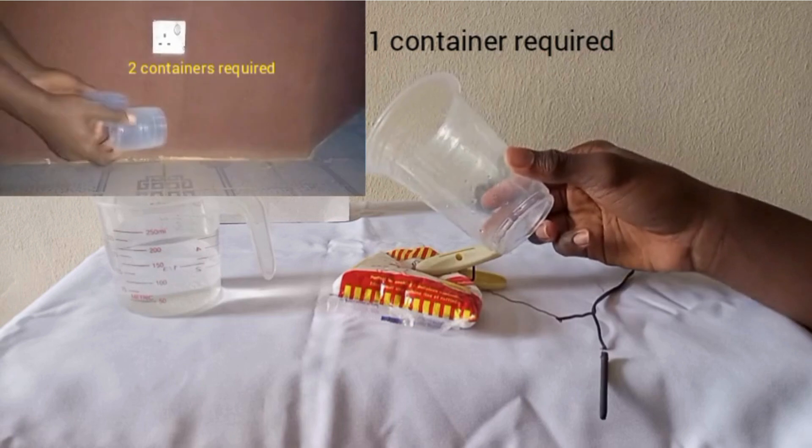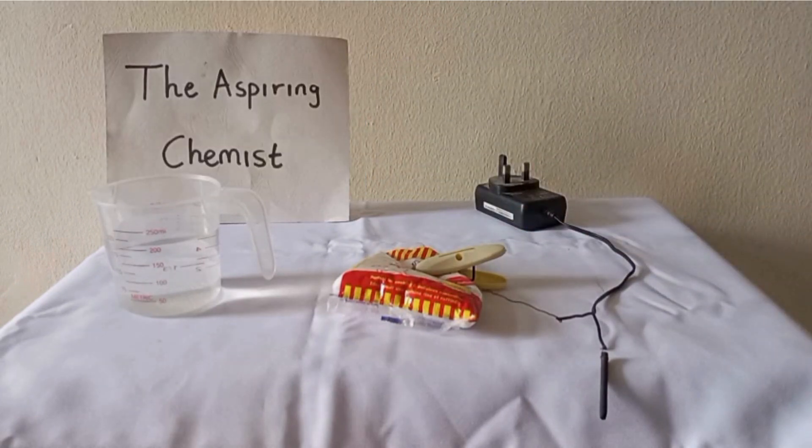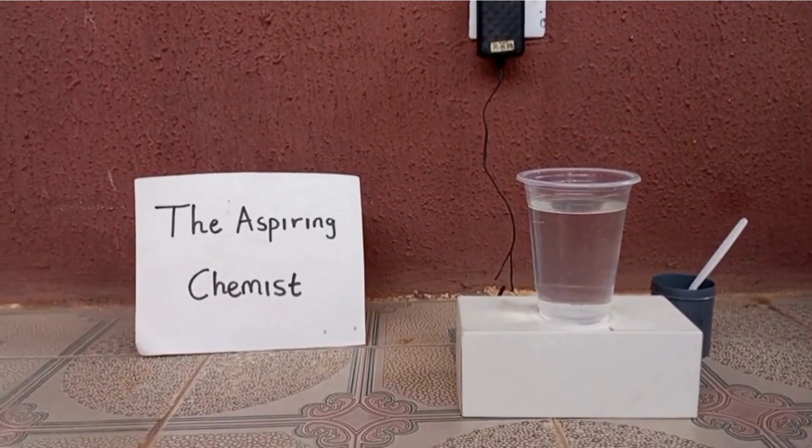The difference is that in this video only one container will be needed for the electrolytic setup. As I mentioned in that video, whenever you do electrolysis of a concentrated salt solution, chlorine gas will be released. So if you're going to perform this experiment, it must be done outside or in a fume hood.